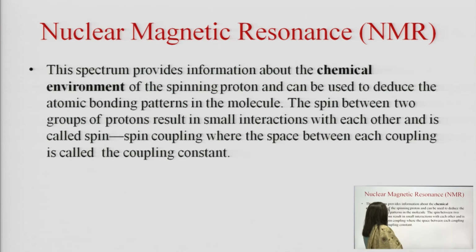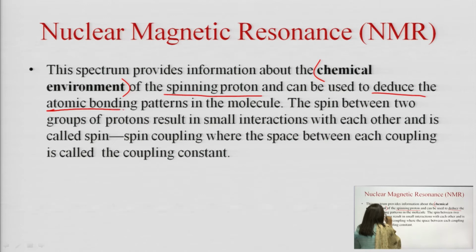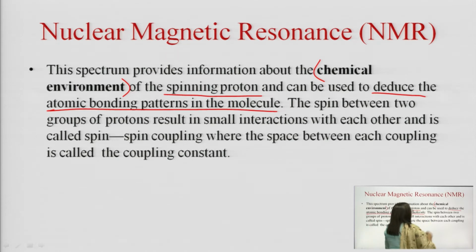The spectrum provides information about the chemical environment of the spinning protons and can be used to deduce the atomic bond patterns in the molecule.